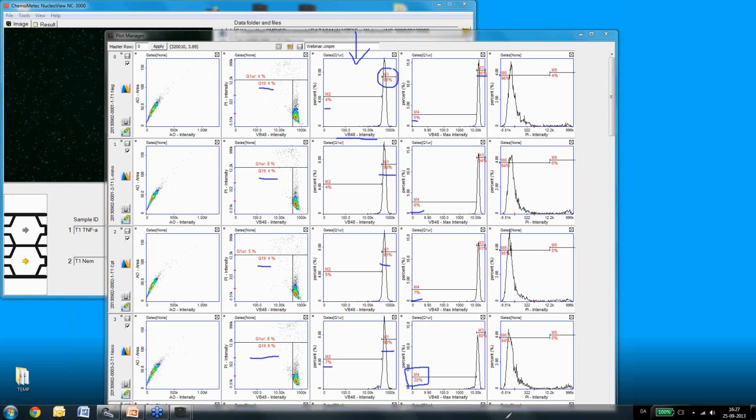So actually we've seen that by looking at this factor, we can see the apoptosis even clearer. This is something only done by image cytometers, where you actually take images of the cells and measure the exact dyes, or to some extent the location of the dyes. So we can see here that when the cells are healthy, the dye is more concentrated. However, when the cells start to go into apoptosis, the dye concentration spreads out, but still internal to the cell, since there's no drop of overall intensity for the cell.